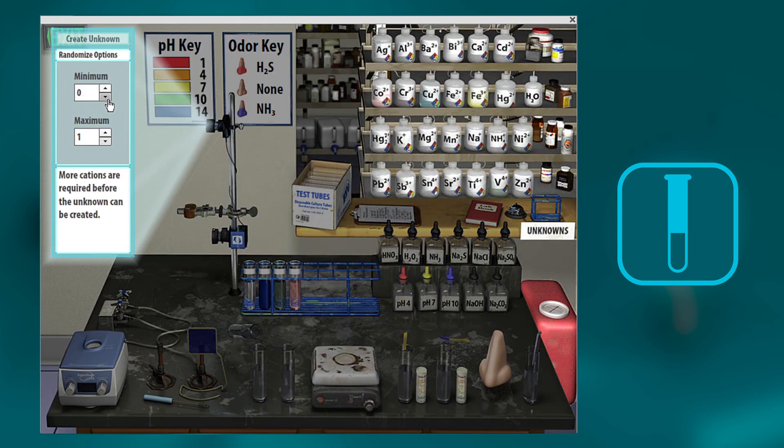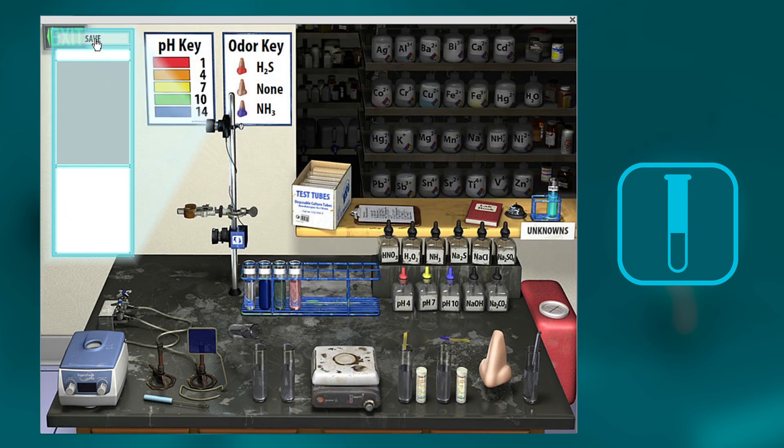So let's say you can have between zero and three cations in there, and we want to say you can do it with cobalt, copper, or nickel. So now this will create an unknown for you so you can practice.